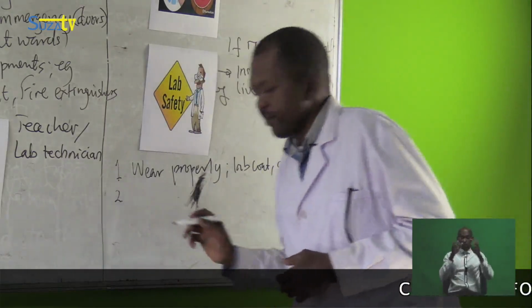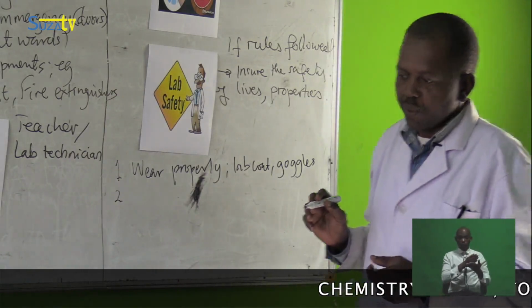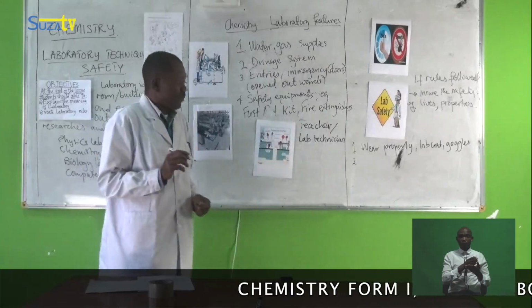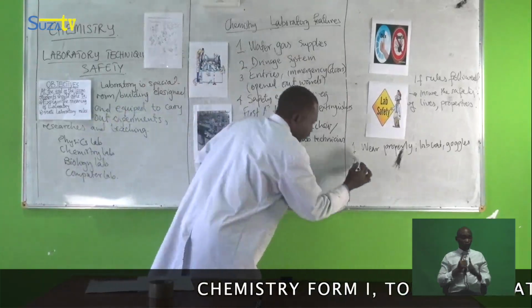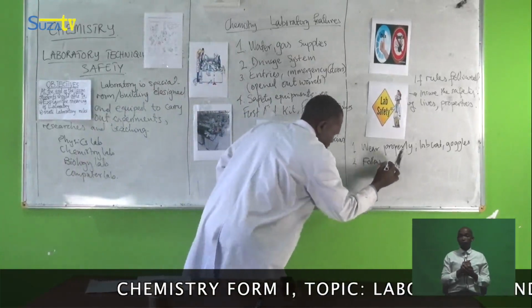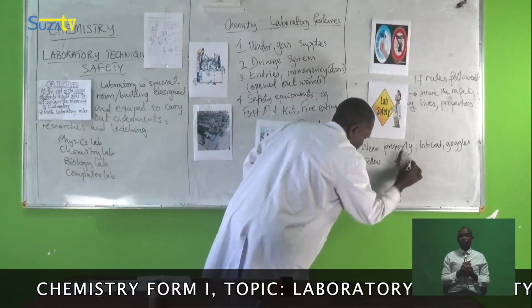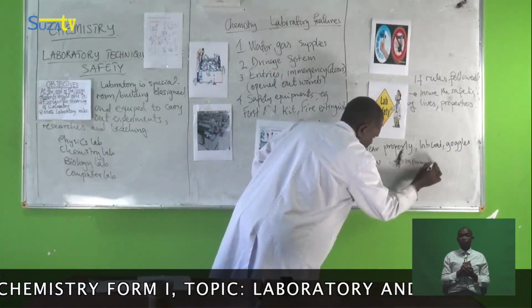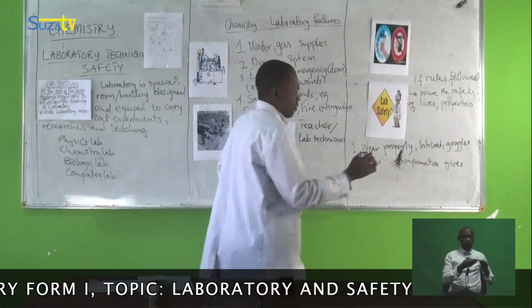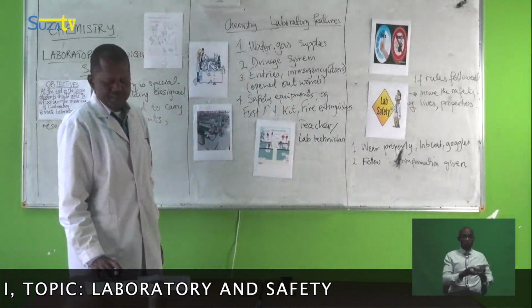Another thing which is very important, make sure that you follow information given either by your teacher or laboratory assistant.